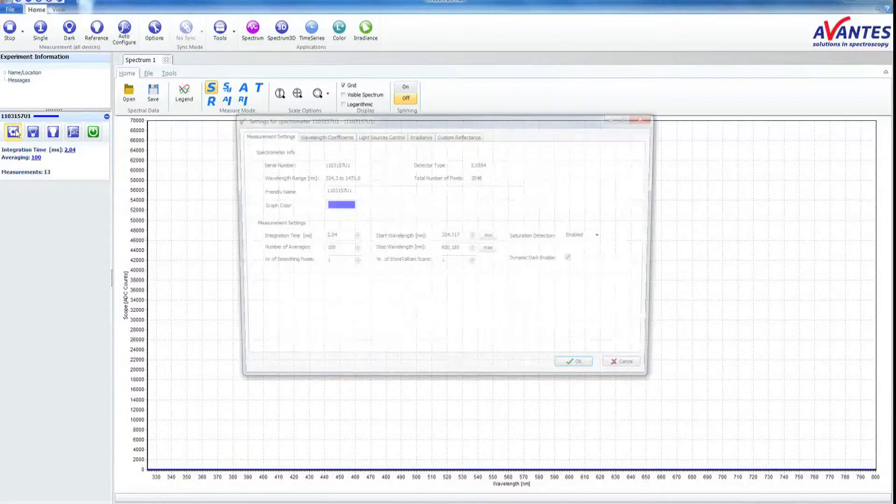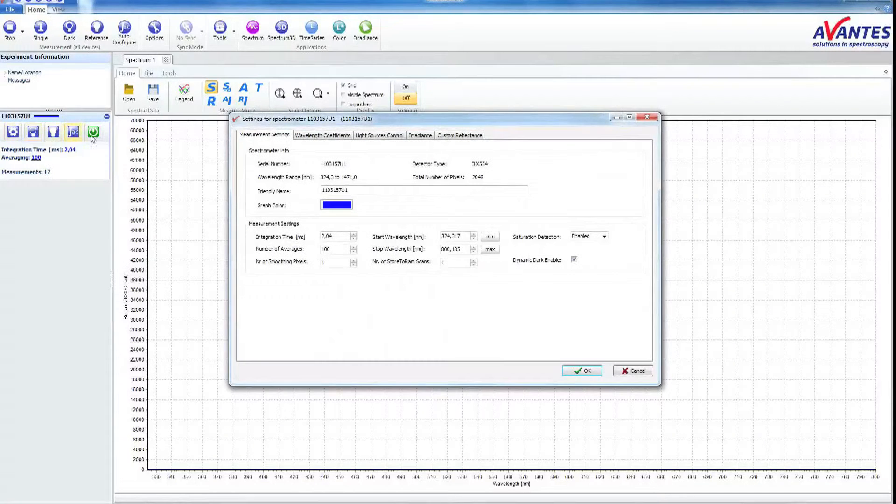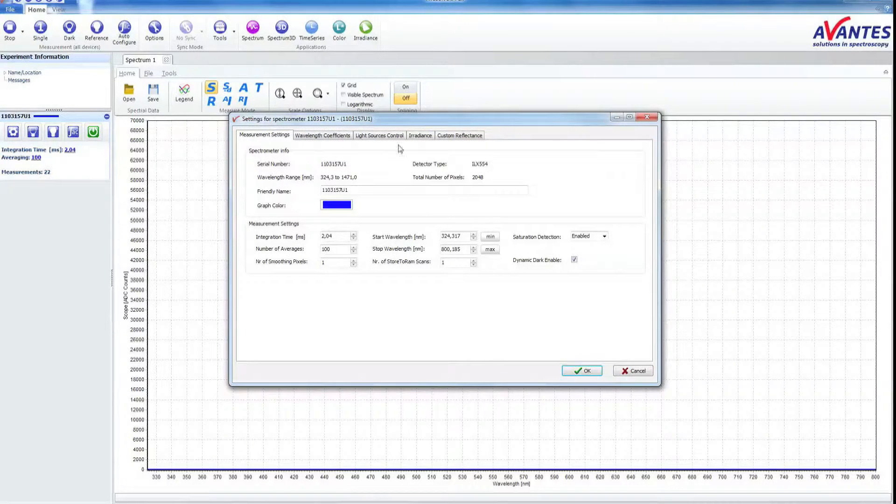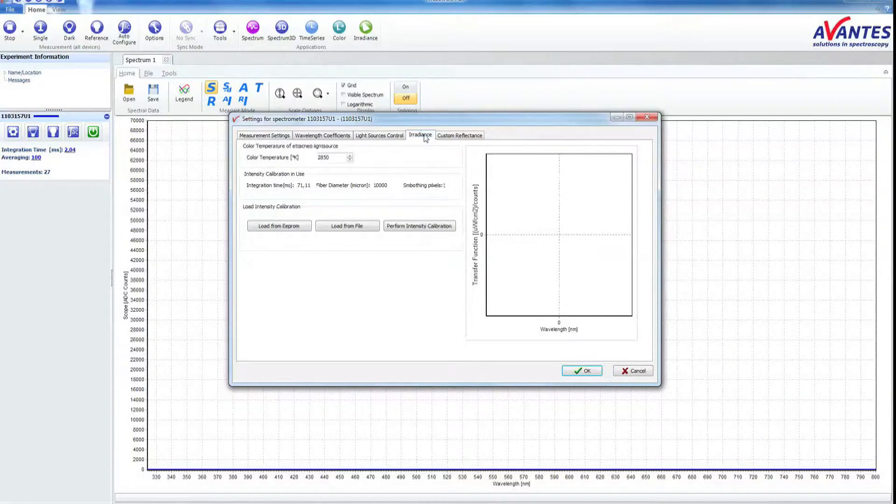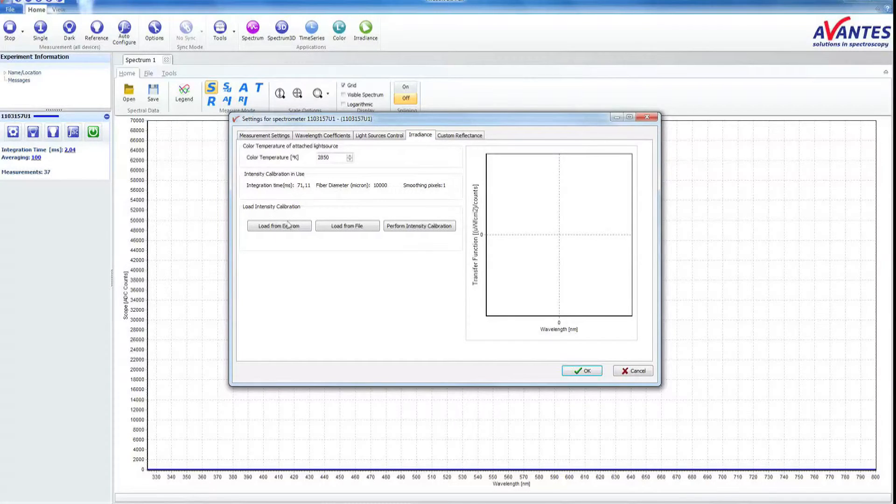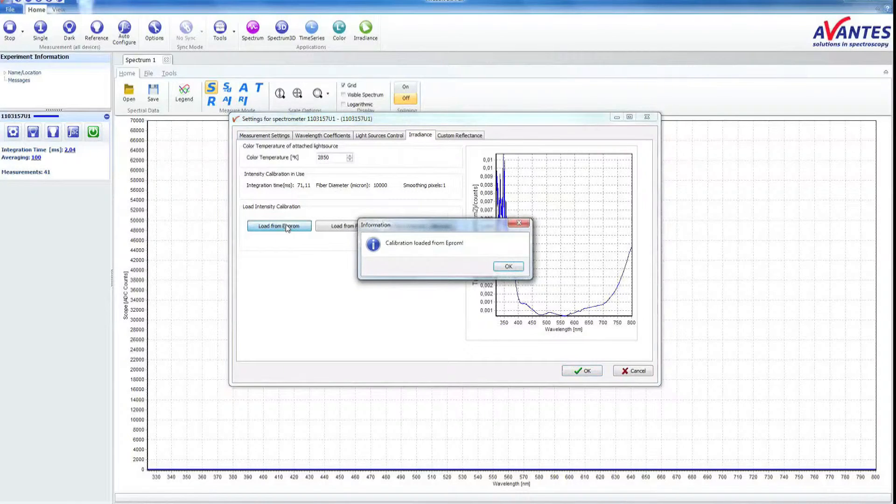Now click the button Spectrometer Setup in the Spectrometer menu. Switch to the Irradiance tab and continue by clicking the Load from EEPROM button.